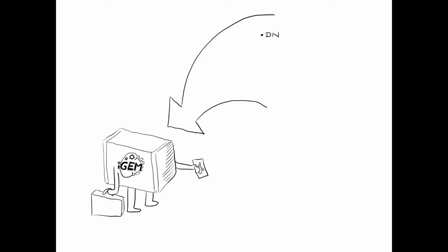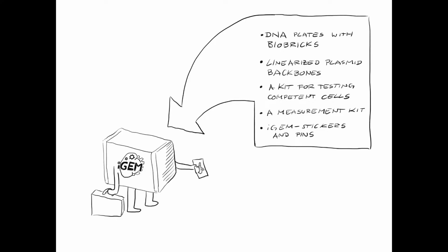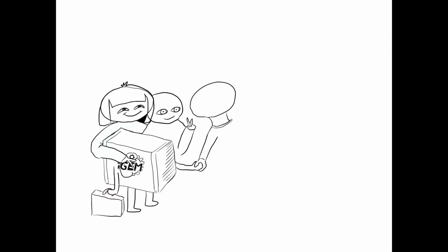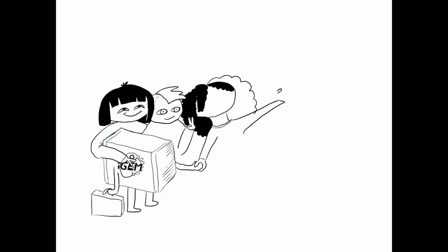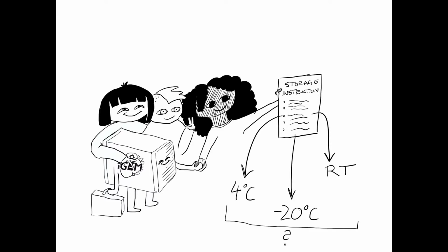the following: DNA plates with biobricks, linearized plasmid backbones, a kit for testing competent cells, a measurement kit, and iGEM stickers and pins. The first two things that you should do when you get your distribution kit are gather your team members and take the most amazing and creative picture and share it on Instagram with the hashtag #WelcomeToIGEM, and pay close attention to the storage instructions of the kit components. Some of them must be frozen, while others must be kept at room temperature.